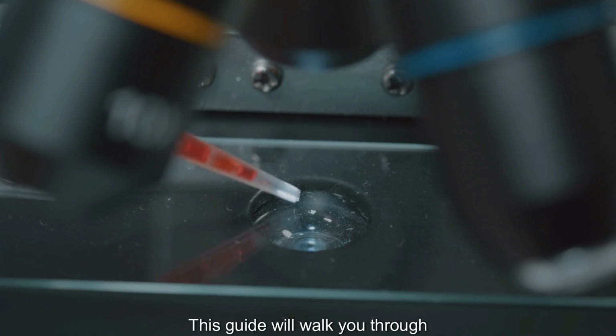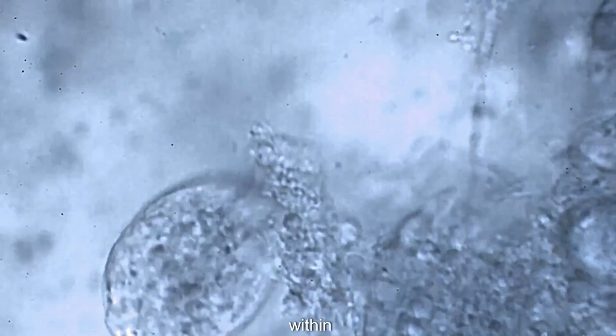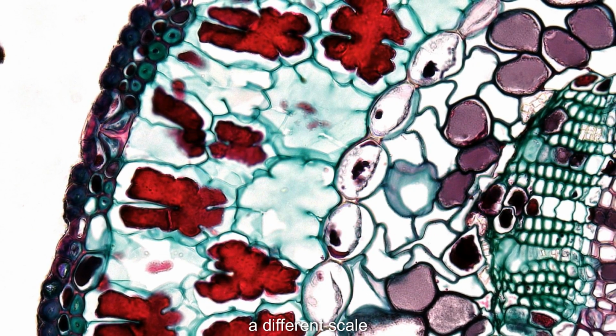This guide will walk you through preparing your first sample, bringing it into focus, and revealing the details hidden within. We will turn a blurry, confusing image into a sharp, breathtaking view of life at a different scale.